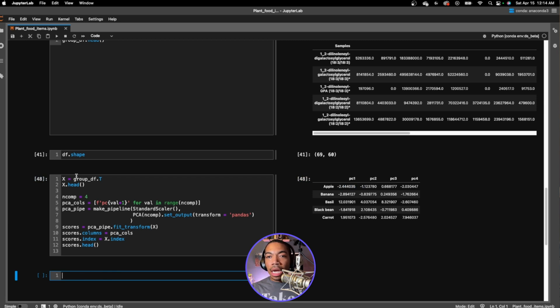And it's going to be kind of code intensive, but again, review this and see these steps and appreciate them more. If you have comments or maybe even a better approach, feel free to let me know, and I'd be happy to take a look.